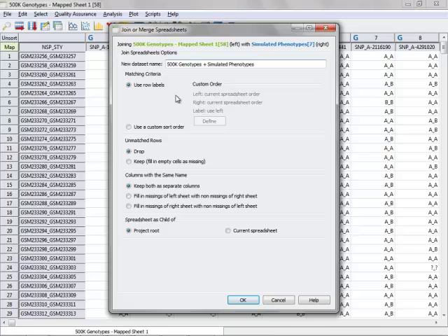To do this, the best way is to ensure that both spreadsheets have the same row labels, as designated here on the left. If by chance you don't have the same row labels, you can either edit those in the spreadsheet editor, or choose a custom order here. But for this particular demonstration, I know that the row labels are matching, so I'm going to leave that as the matching criteria.